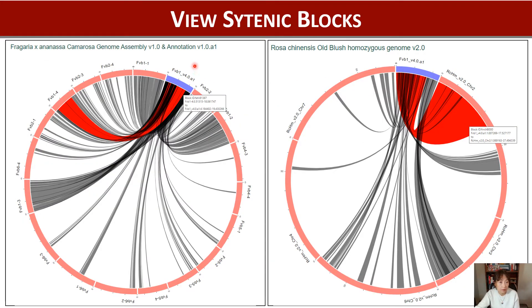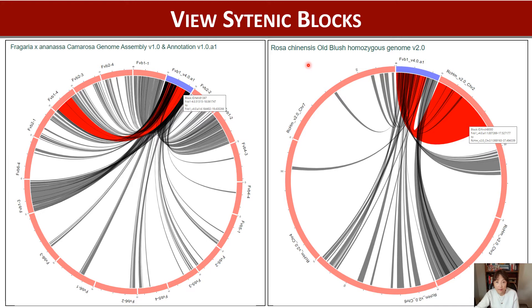This shows synteny blocks between Fragaria vesca and Fragaria x-Ananassa. Fragaria vesca is a diploid and x-Ananassa is an octoploid. So as you expect, major synteny between one chromosome of vesca and four chromosomes of x-Ananassa are shown.